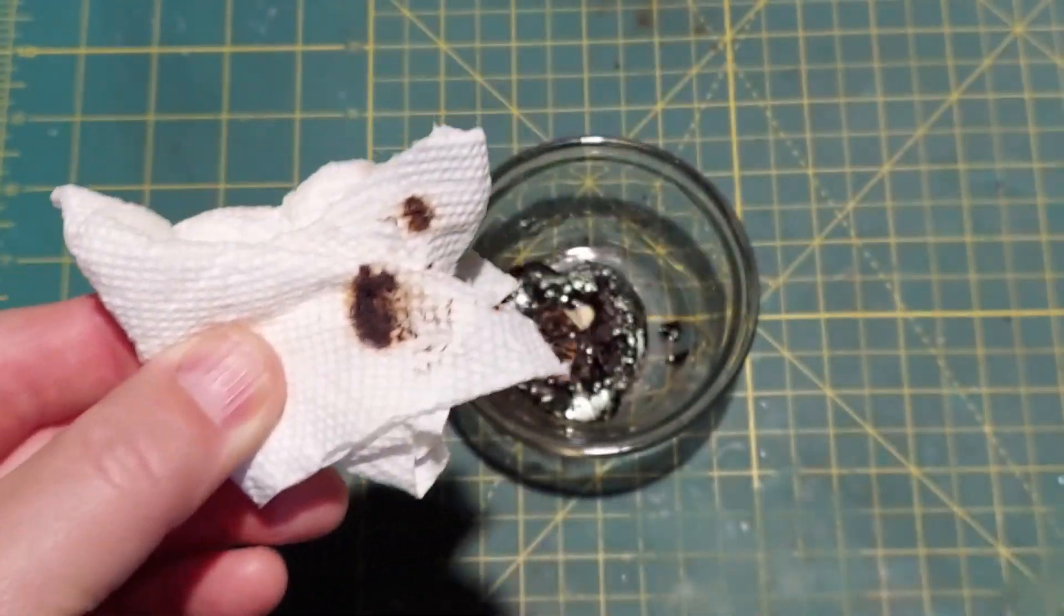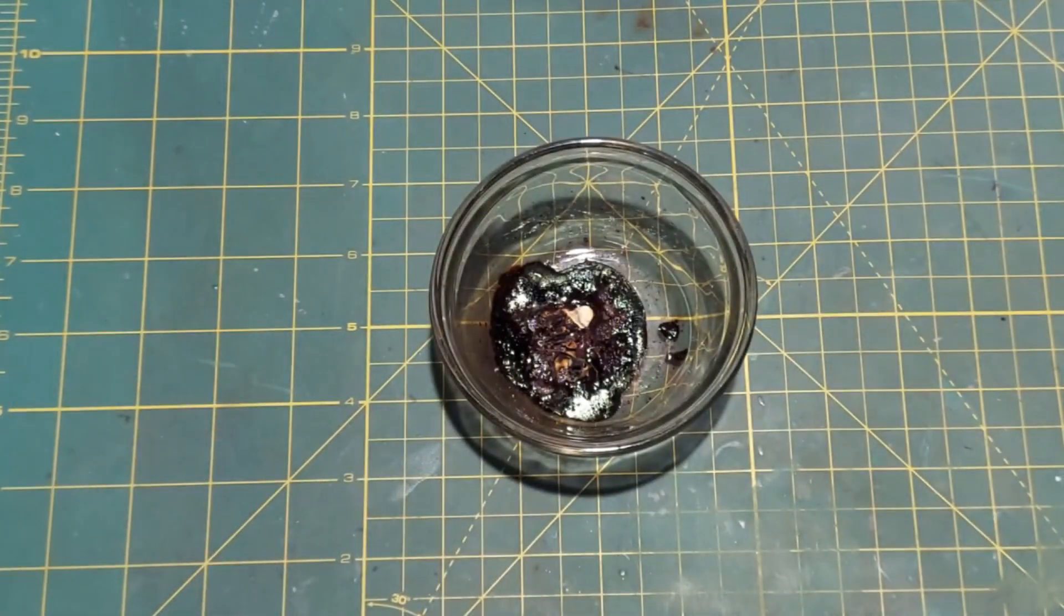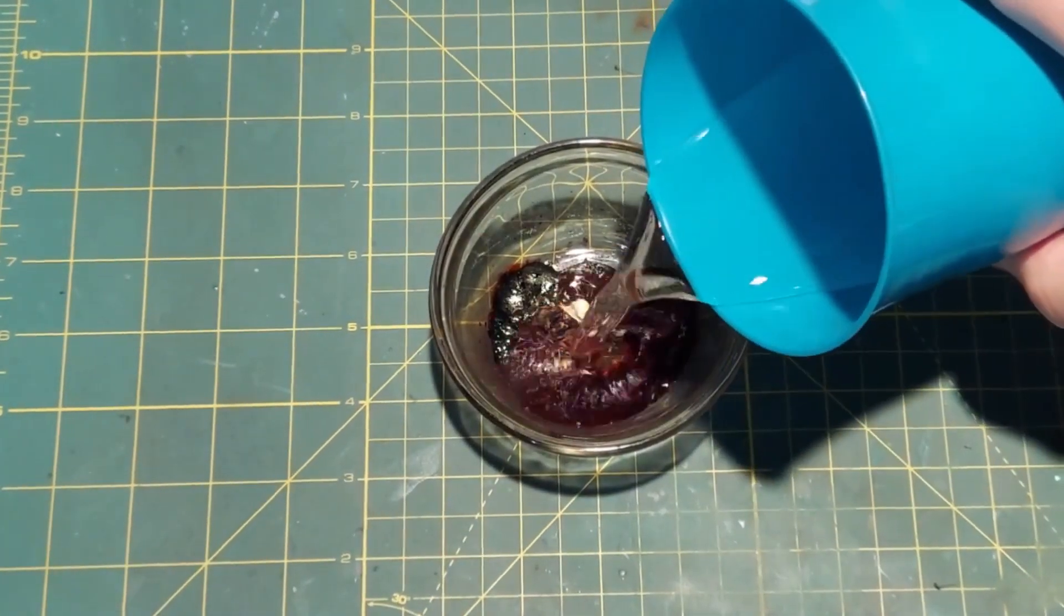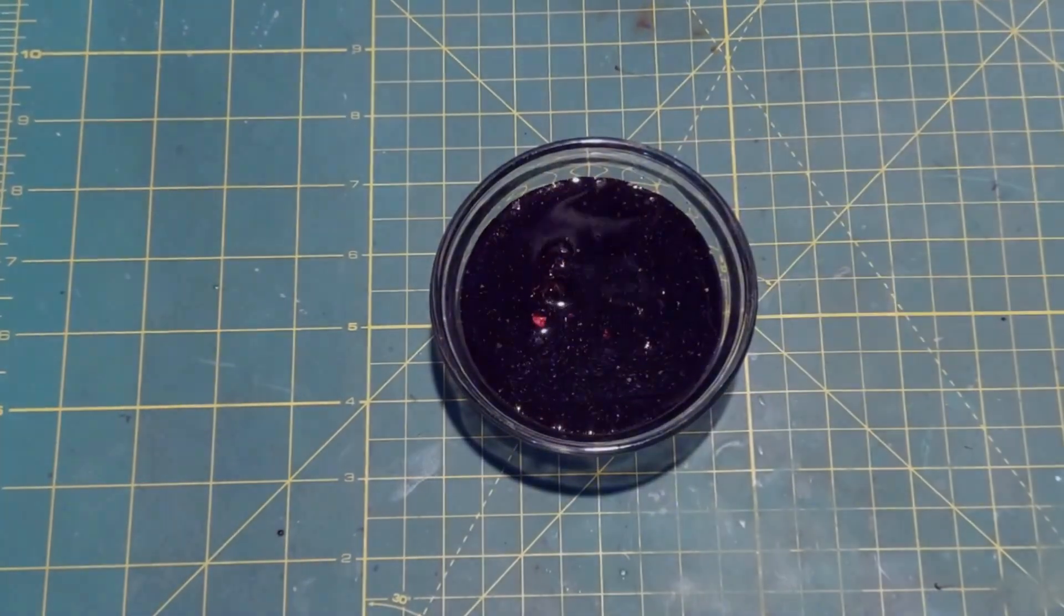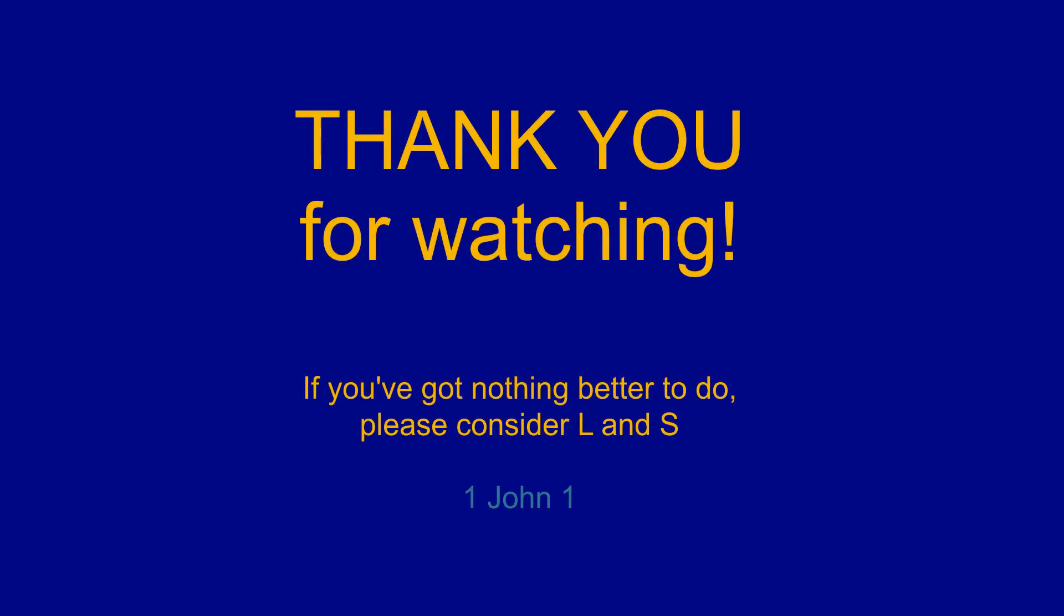Okay. Obviously, you got to be careful to clean up. Lots of water. There we go. So yeah, thank you.